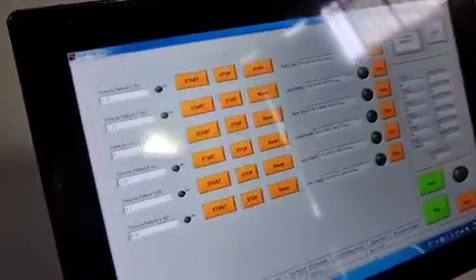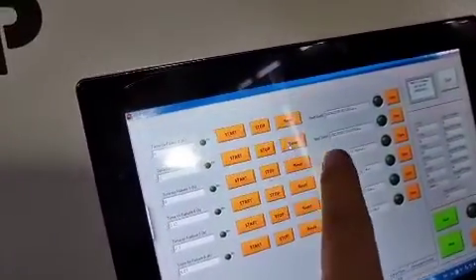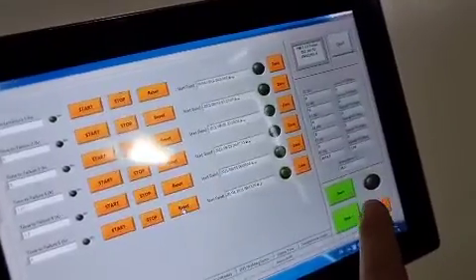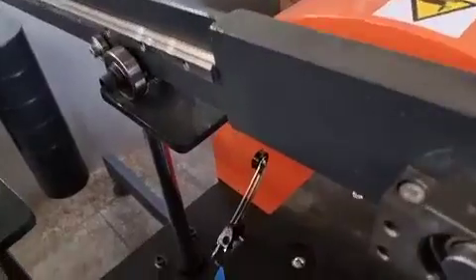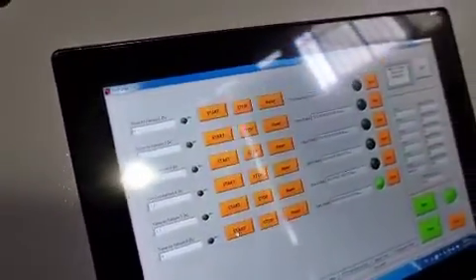You will come to the time-to-failure page. You need to reset each channel you are going to test, then click Start. The timing for each station will start, and whenever a sample fails and the switch is activated, that channel's timer will stop automatically.